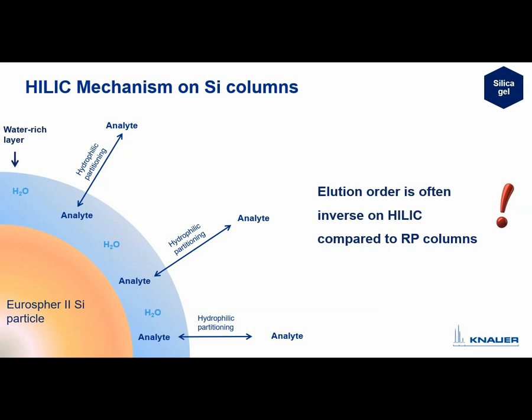And if you have an analyte where you can do this and compare both modes, often the retention times are inverse, so the elution order is inverse in HILIC compared to reversed phase, just because the mechanism is completely different. So some analytes that are not retained in reversed phase or really badly retained in reversed phase can be used in HILIC very well.